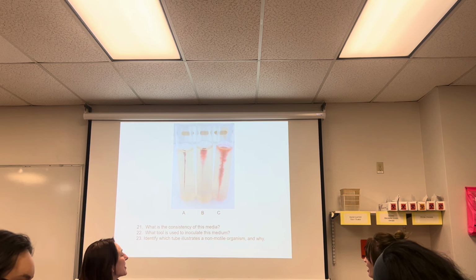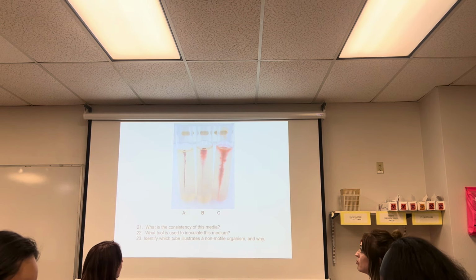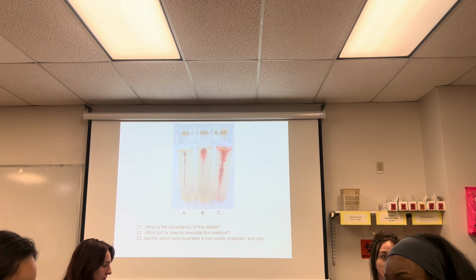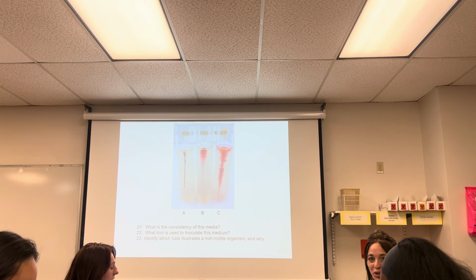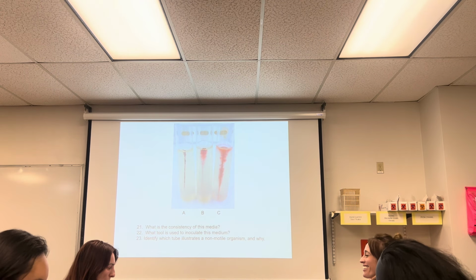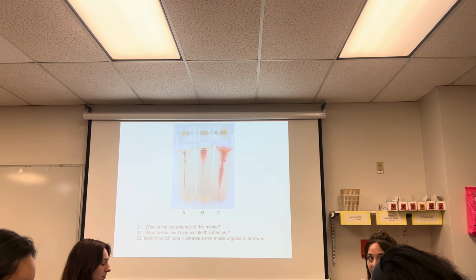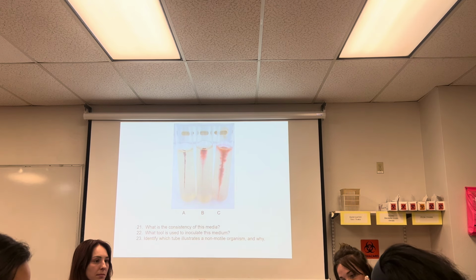Motility media. Very easy. So what's the consistency of motility media? It's a semi-solid. What percent agar is in motility media? 0.5. Good job, Bree. I don't believe that. What tool is used to inoculate the media? A needle. A needle is fine. You can say needle, you can say inoculating needle. You cannot say long, straight thingy.